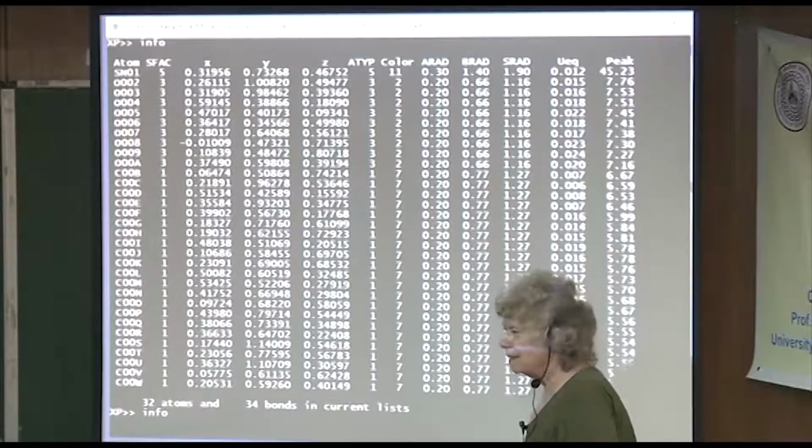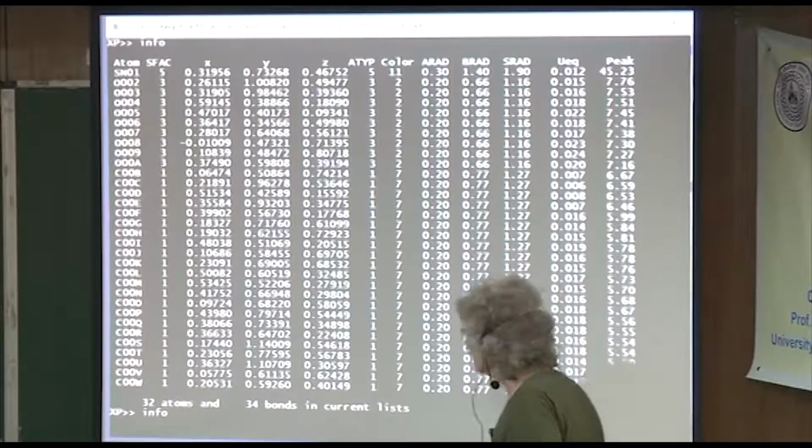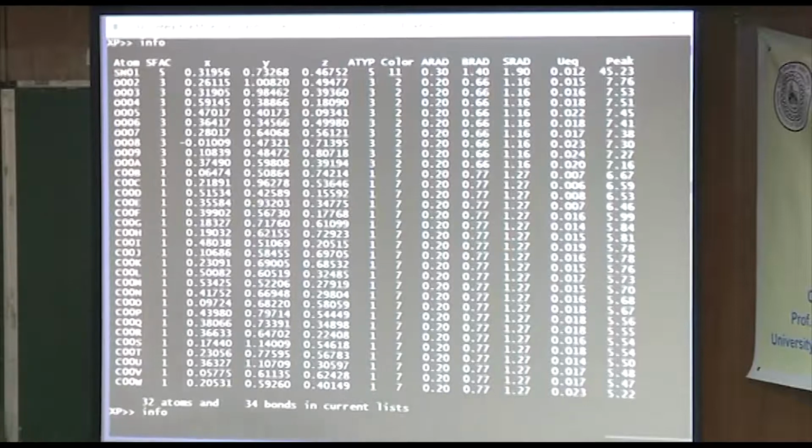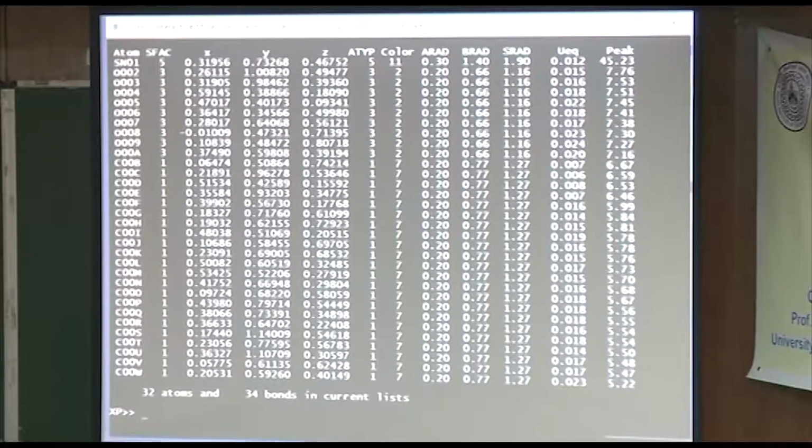So you do have a nice table here. You don't have to go look it up somewhere else. Those are pretty accurate, I think. So there's a lot of information there. Okay, so I'm just going to take this and write it back as an INS file and refine it.